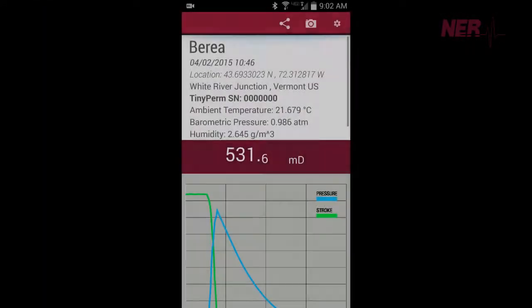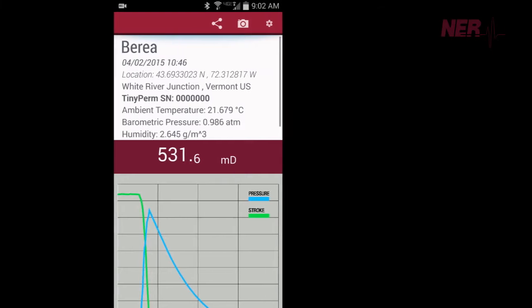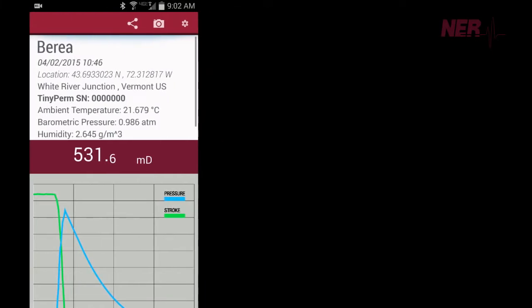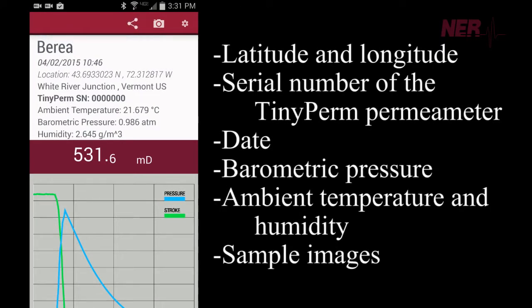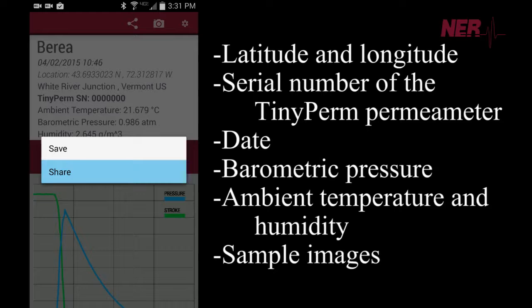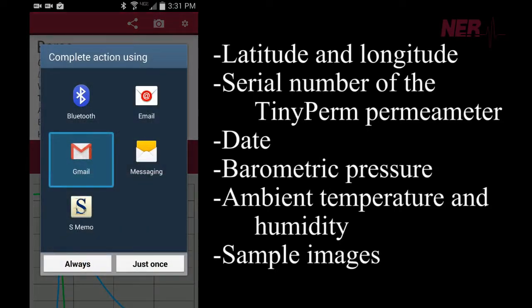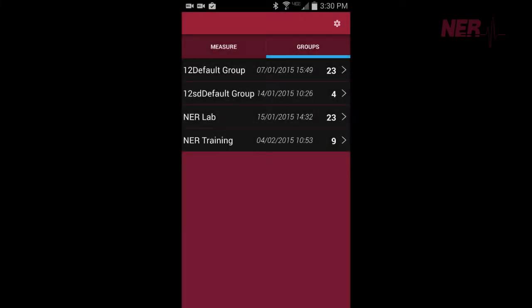The measurement data, along with GPS-derived latitude and longitude coordinates, serial number of the TinyPerm permeameter, date, barometric pressure, ambient temperature and humidity, and sample images are captured in data files that are easily exported from the Android device to desktop computers for additional analyses.